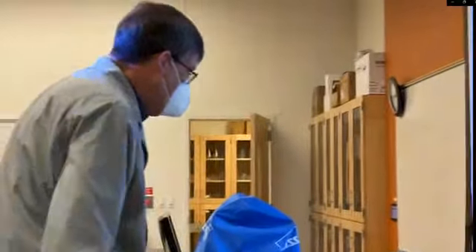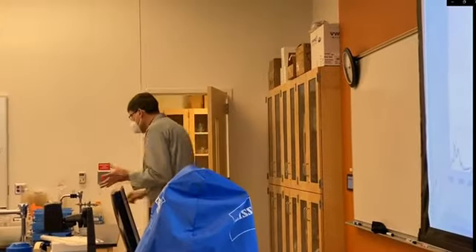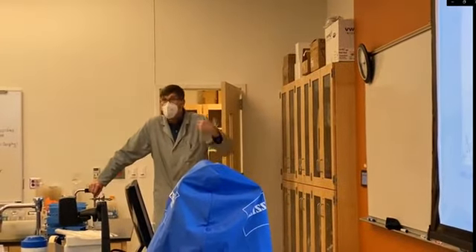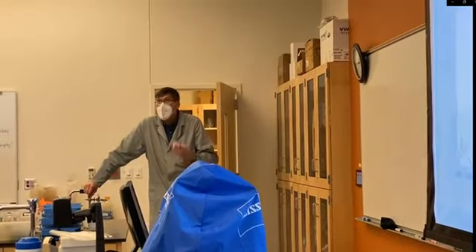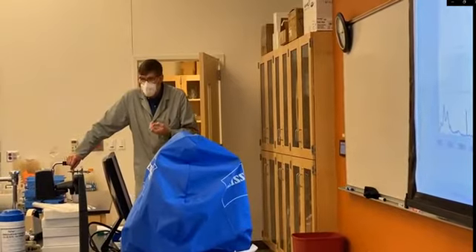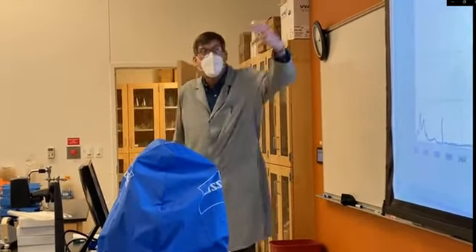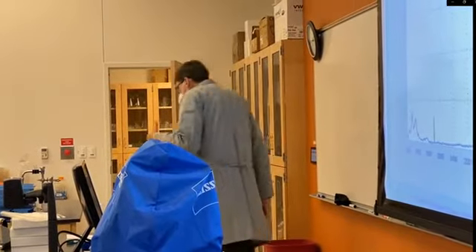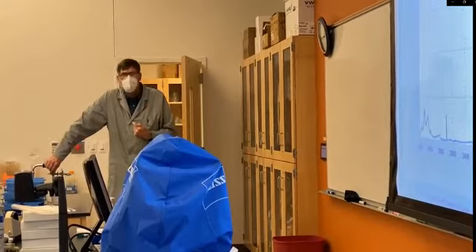We'll put that information into a spreadsheet, and then you can, or I will post the spreadsheet so you can use Excel to do the linear regression, get the slope and intercept value, and then we'll also scan our two samples and put that information into the spreadsheet, so then you can take the intensity value of the samples using the slope and intercept that you calculate from the regression.